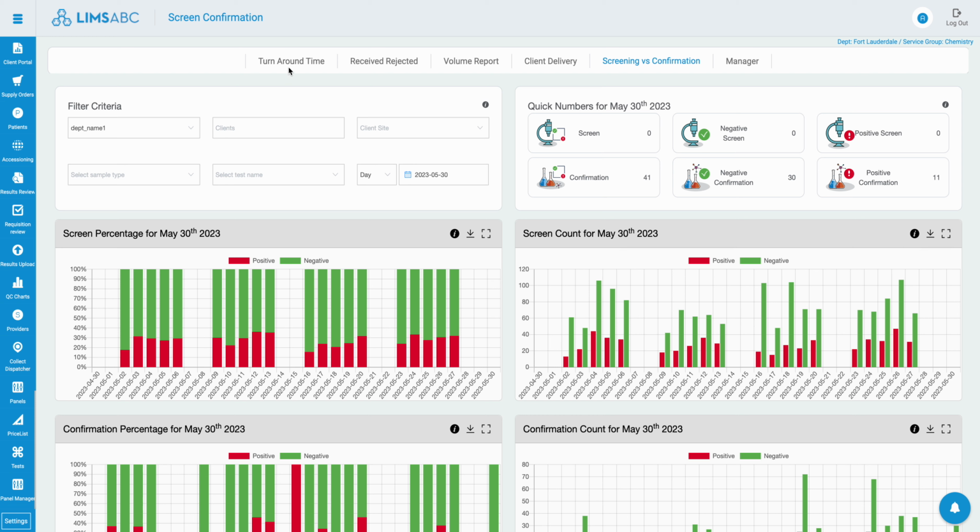With our new analytics, we can also build new custom analytics specific for the lab. So if anybody is interested in any custom analytics based on the process in the lab and based on the clients, we can definitely build those analytics, and just contact our support.